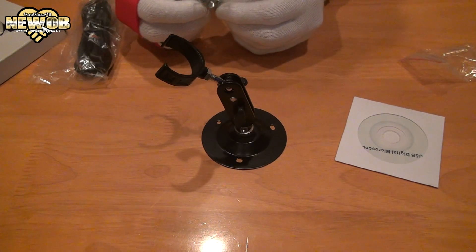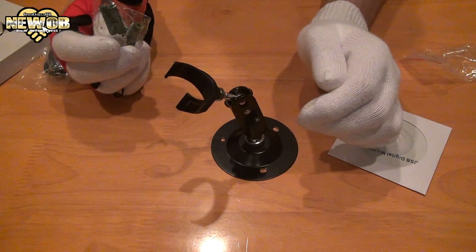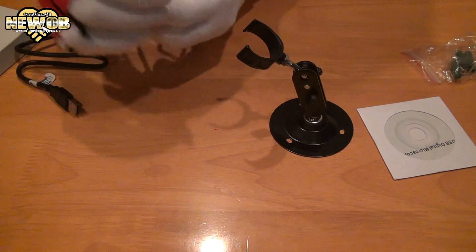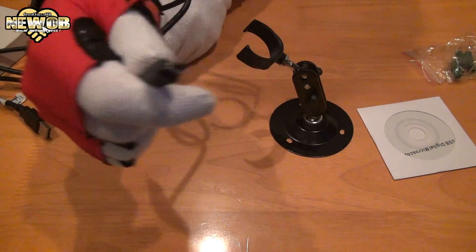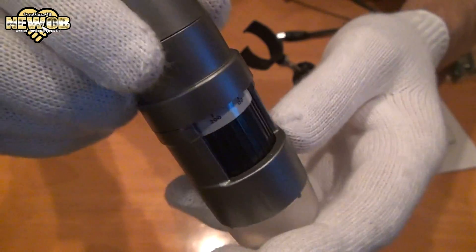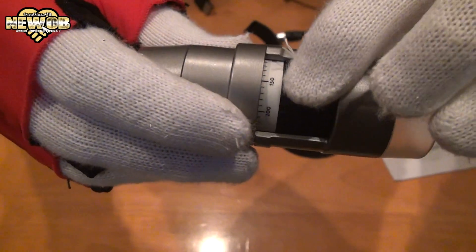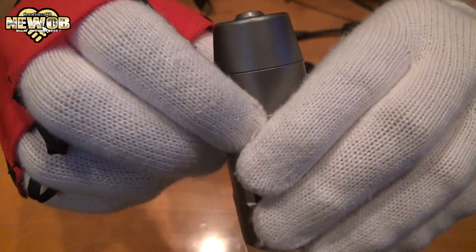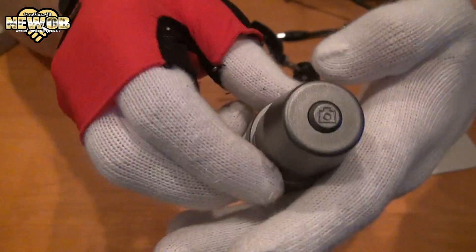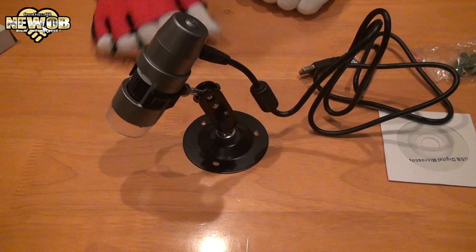We've also got this — not sure what it's for, maybe if you want to actually screw it into something, though I don't see why you would. This part will obviously go into the USB port on the computer, and this part will go into the microscope. Taking a look at the microscope all around — you can move this to zoom in or zoom out, and this button is probably for taking a photo or starting to record. Let's plug it in — microscope ready for action.